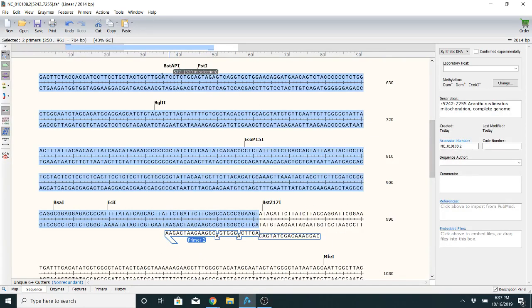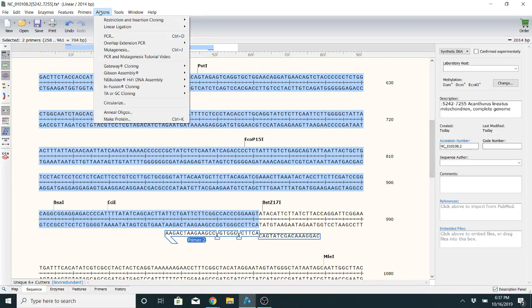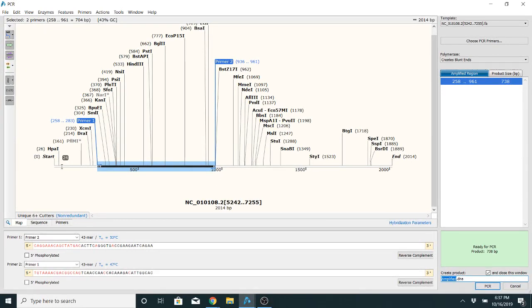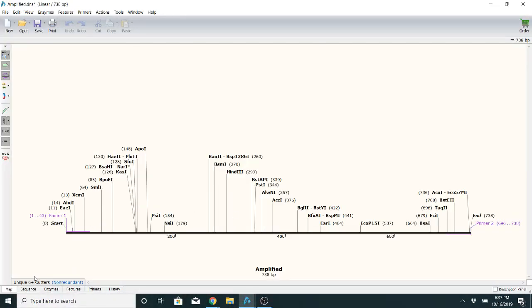And if we model this PCR reaction, it goes PCR. And so here's this gene. It'll go from primer 1 to 2, and you can see none of these 5' tails bind, but it doesn't matter because we extend from the 3' ends. We'll model the PCR, and then we have these.